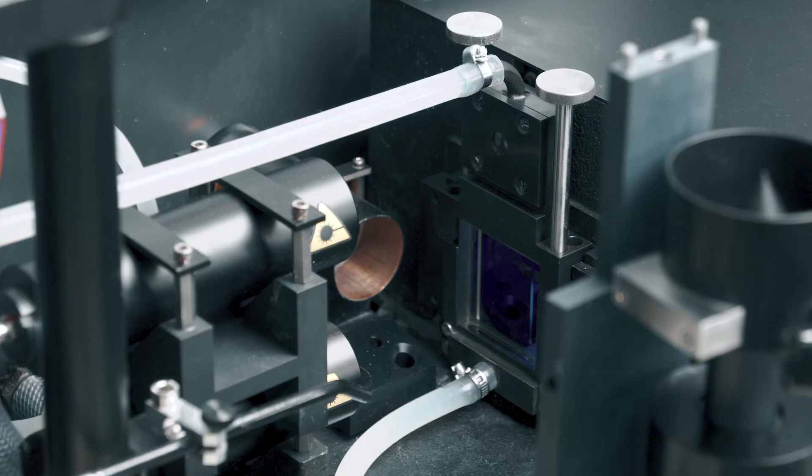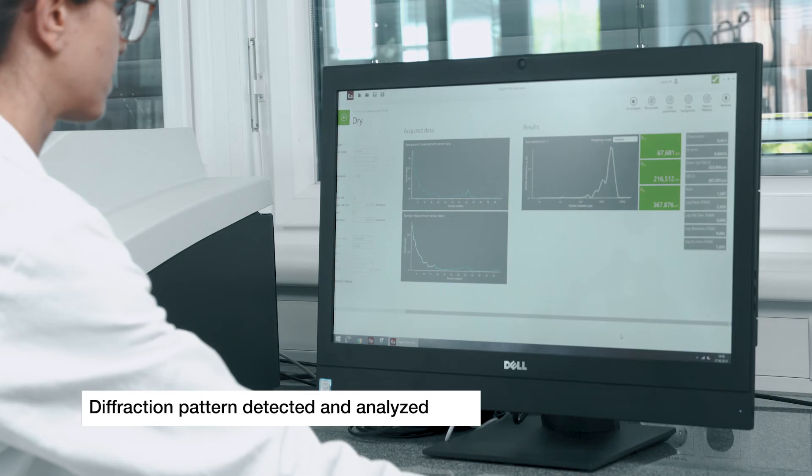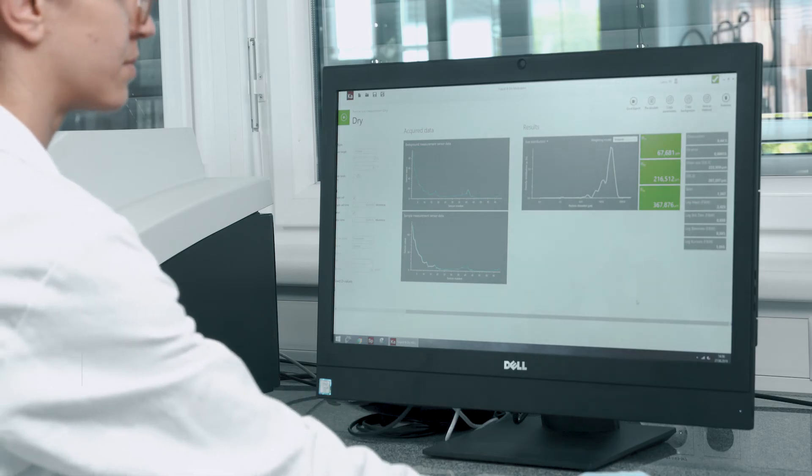The measurement is continued. The instrument detects the diffraction pattern caused by the particles flying through the laser beam. At the same time, the software interprets the data, and at the end of the measurement, the results are displayed on the same page with the measurement setup.